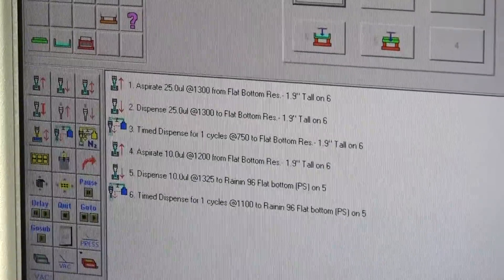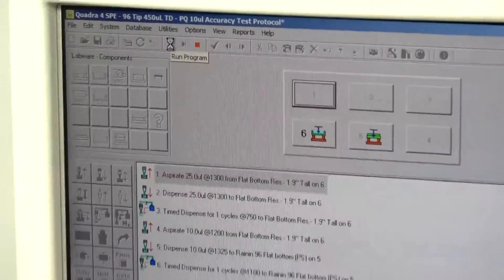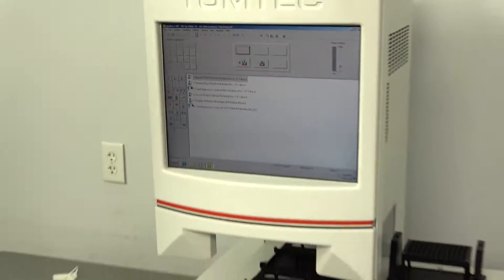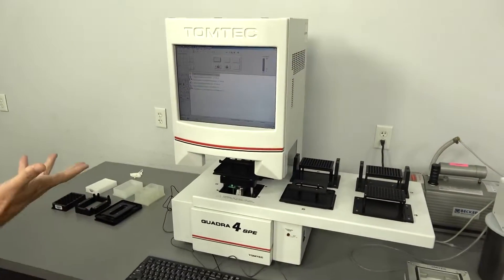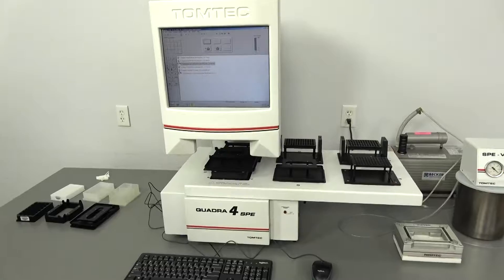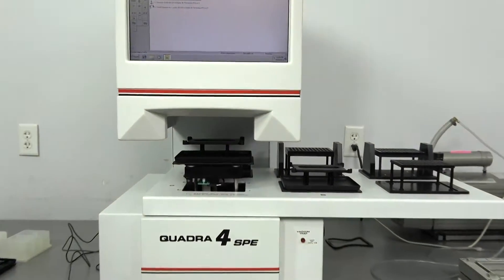As you press the play, the unit will go ahead and run the program as desired. It lifts the plate into the head, this has a 96 well head.